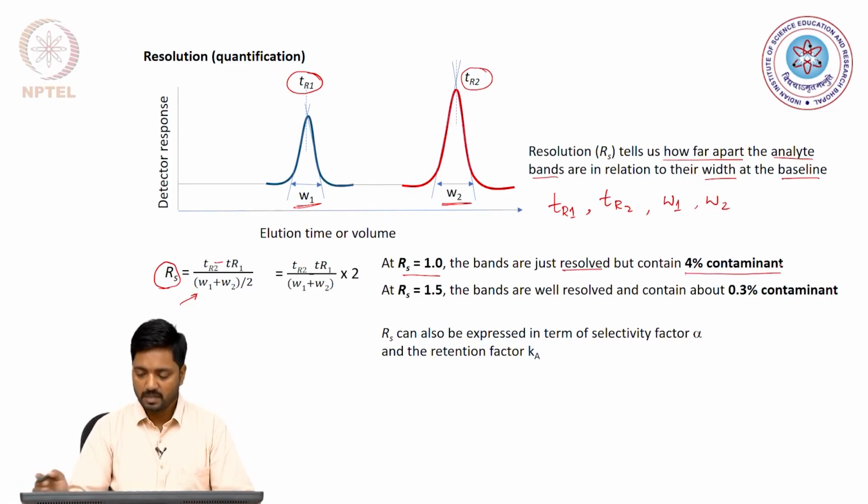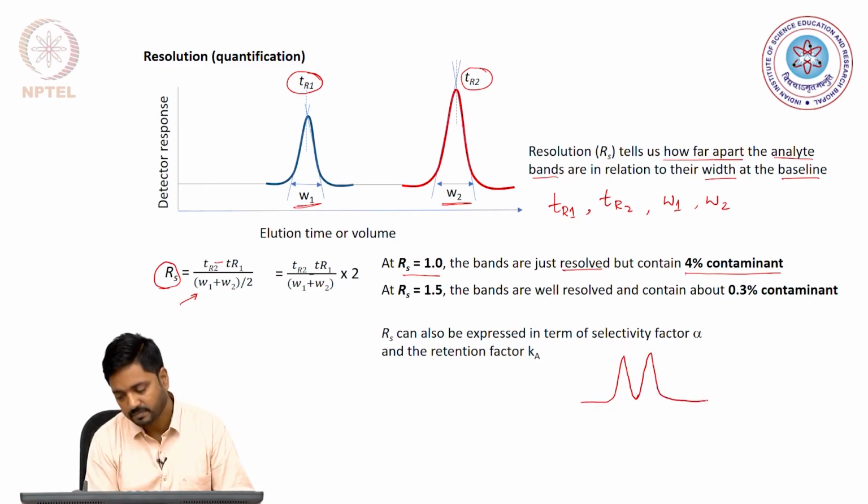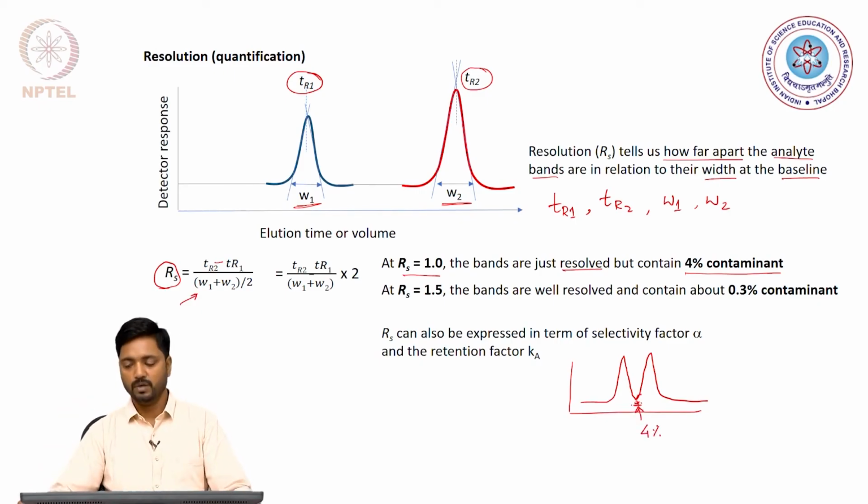So, that means we will be talking about a chromatography profile where we have something like this, and if we extend this, the regime here will contain about 4% of the other analyte.